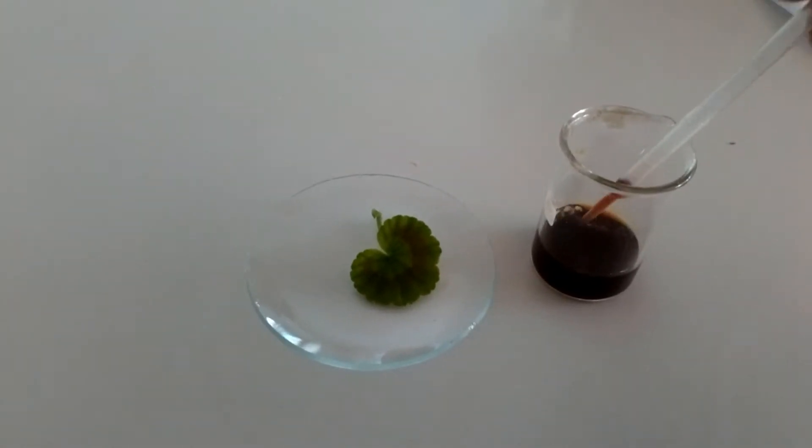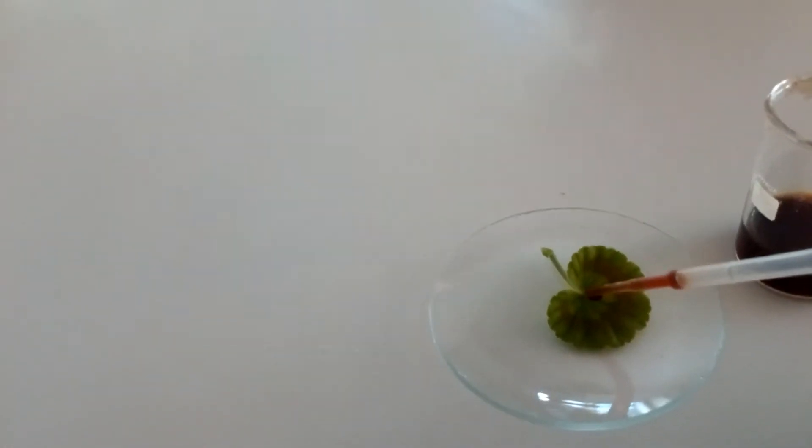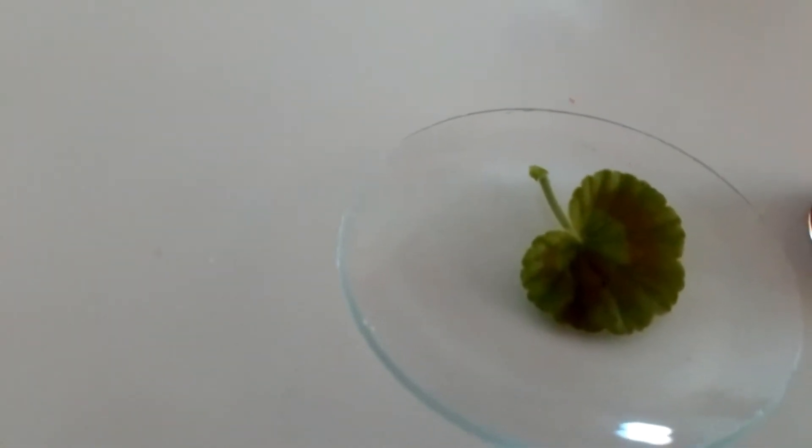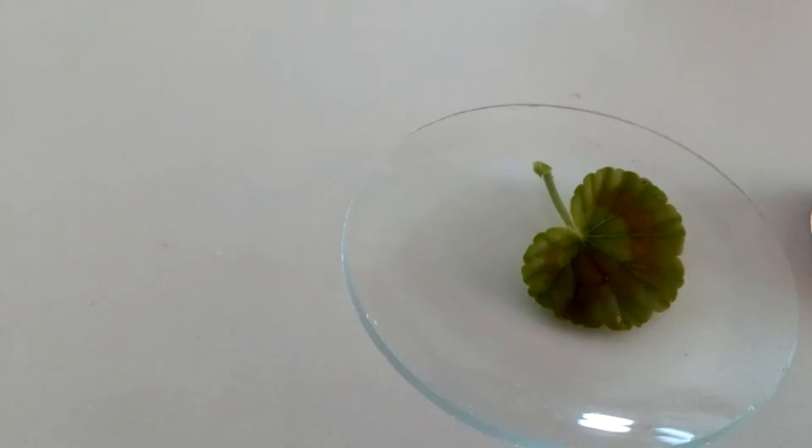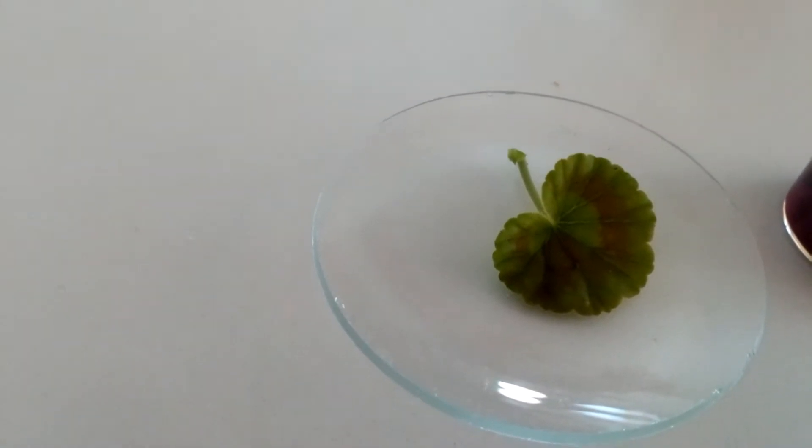And so if I take some iodine solution here and place it onto my leaf, the iodine solution can't penetrate the cells in order to get to the starch if it was present. And so it just rests on the surface. Also we wouldn't be able to see it because of the green color on the leaf.